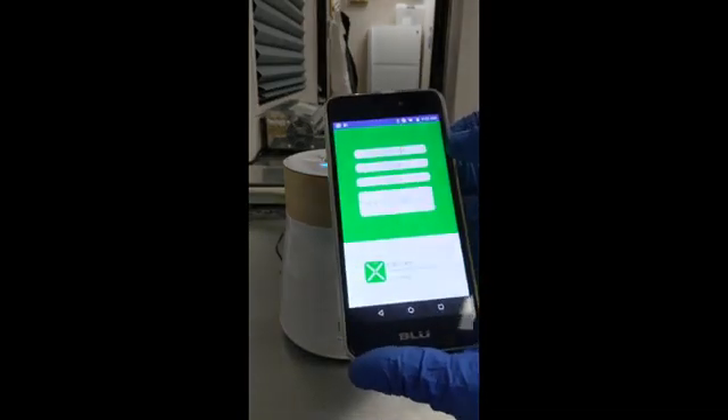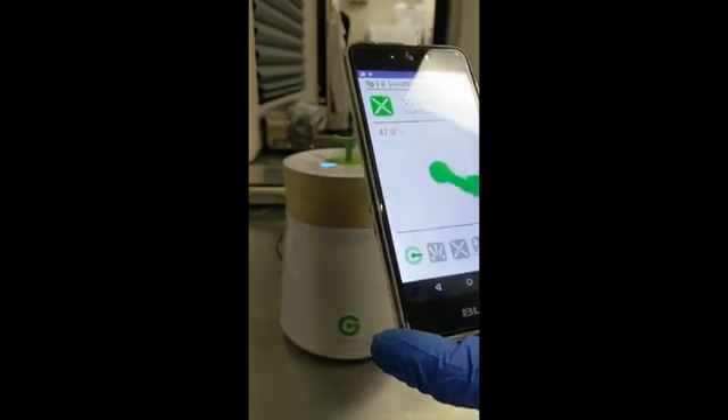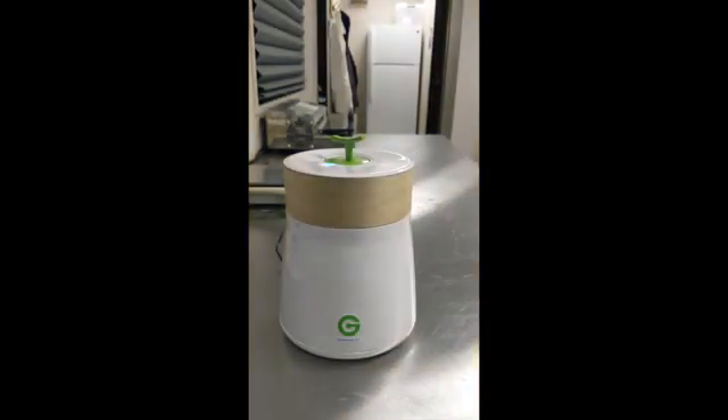We put in 'mimosa' here as a name to make this simple, and you hit calibrate. The calibration process takes about a minute, but it does have to warm up. If it's a cold unit, it can take up to 15 or 20 minutes to warm up, but once it's warmed up, it's about 60 seconds for the calibration.